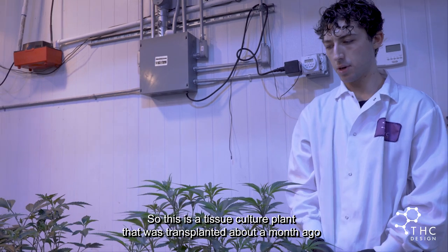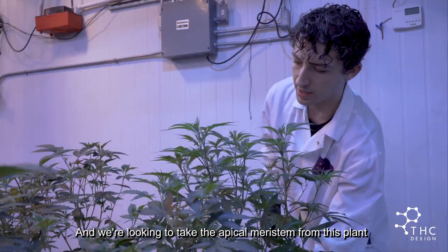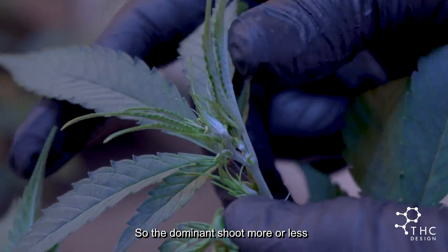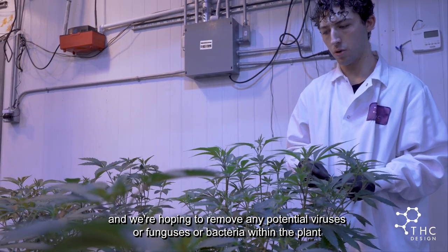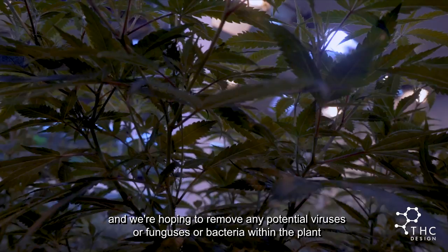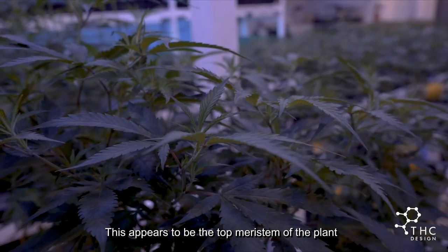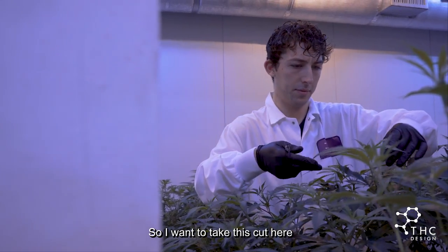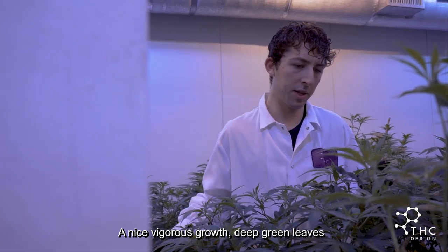This is a tissue culture plant that was transplanted about a month ago. We're looking to take the apical meristem from this plant — the dominant shoot, more or less — and we're hoping to remove any potential viruses, funguses, or bacteria within the plant. This appears to be the top meristem of the plant, so I want to take this cut here. Nice vigorous growth, deep green leaves.